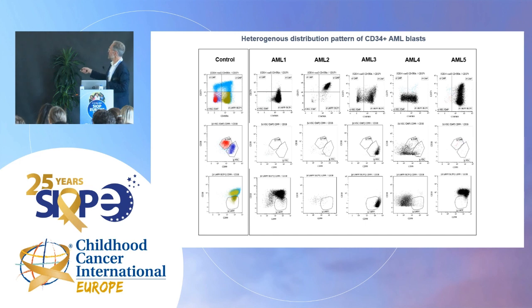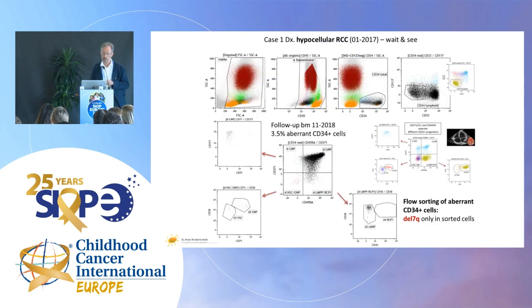So this chart can really be used as something like, let's say, a different-from-normal aspect. So we are not looking at a leukemia-associated phenotype in a way where there is a single marker helpful, but we are looking at where in this chart do they appear.